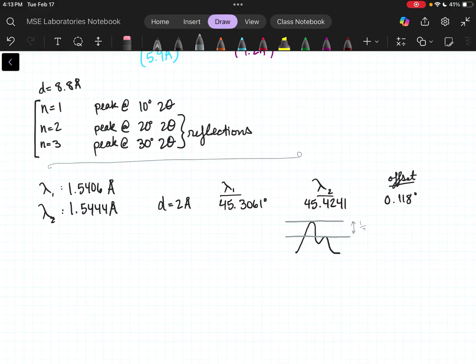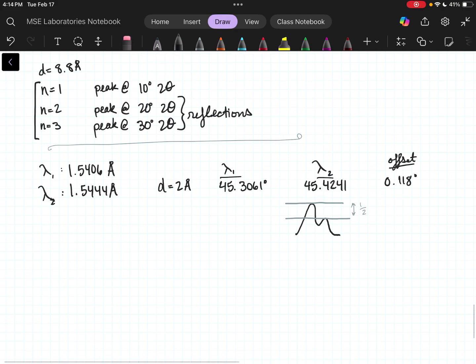One easy way to tell that it is K alpha 1, K alpha 2 is the height of the second peak is usually about 1/2 of the total height of the big peak. And there's a little bit of space here where both of them were kind of happening at the same time, so it doesn't usually drop all the way down. But at much, much higher angles, it will sometimes drop down entirely. They'll just be right next to each other. They will have this predictable offset. And you're like, yeah, that's K alpha 2 for sure. So that's on the rightmost side of the graph.